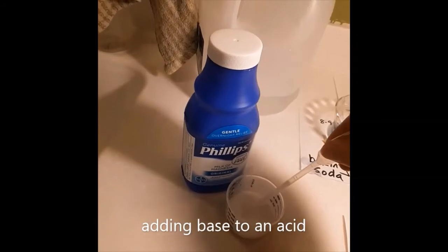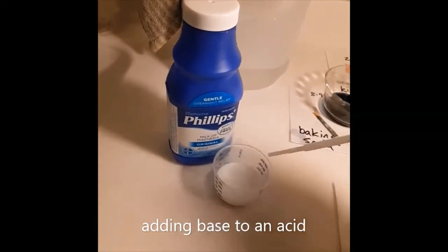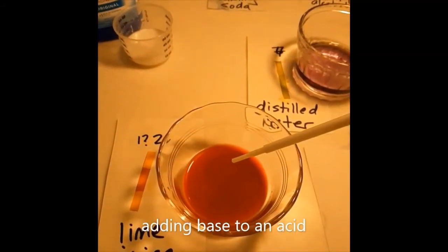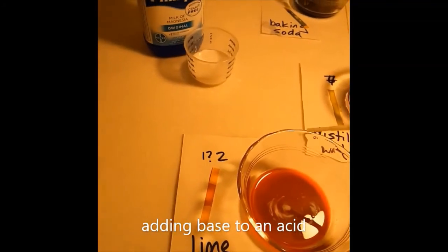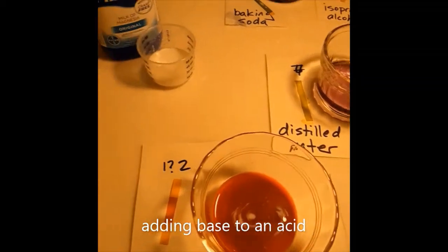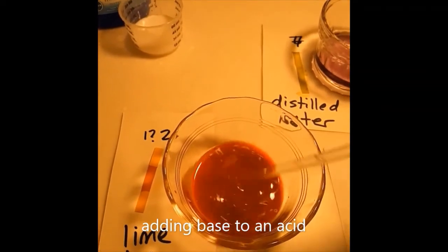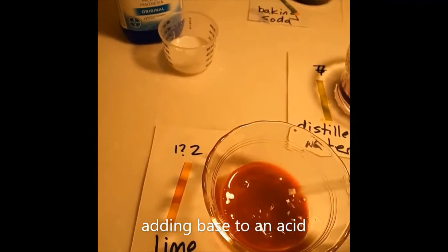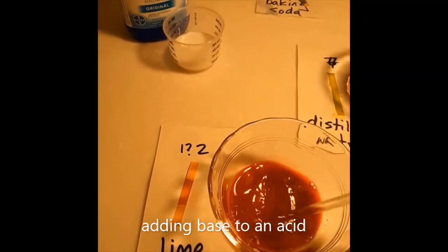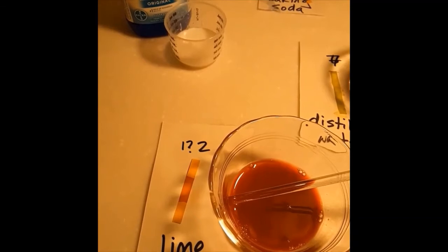So this is a base. I'm going to take some of this base and drip it in here, and see if I can get it to become less acidic and eventually become neutral. So what I'm looking for is it to become that purple color like the distilled water.